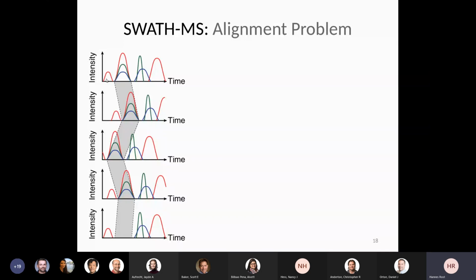So you have the same set of signals, but they are shifted through squeezing and pulling in retention time, and you basically need to make an alignment across these different chromatograms to ascertain identity between all of these different peaks, and also deal with patterns where maybe you do not actually see a signal, right? Where basically the signal is below the limit of detection.